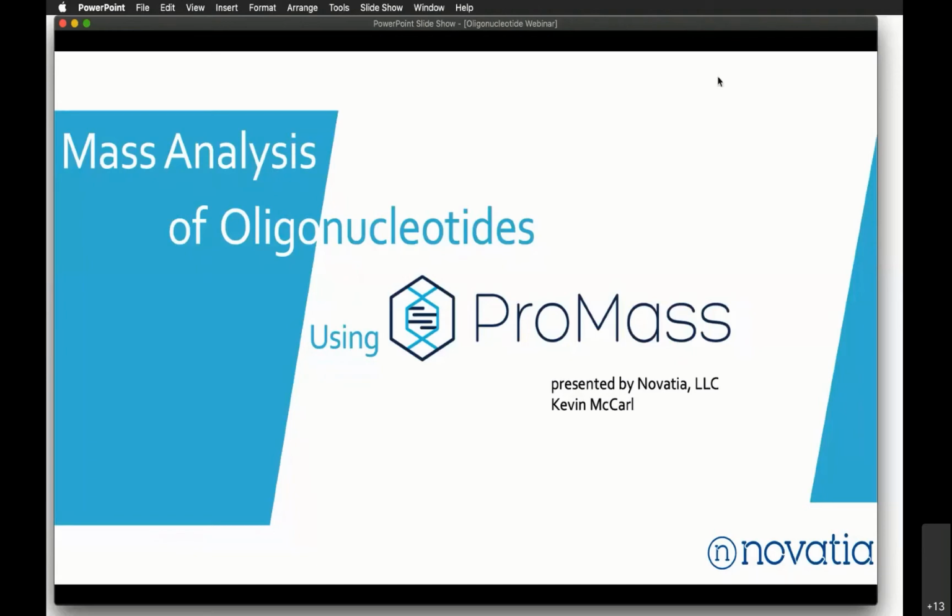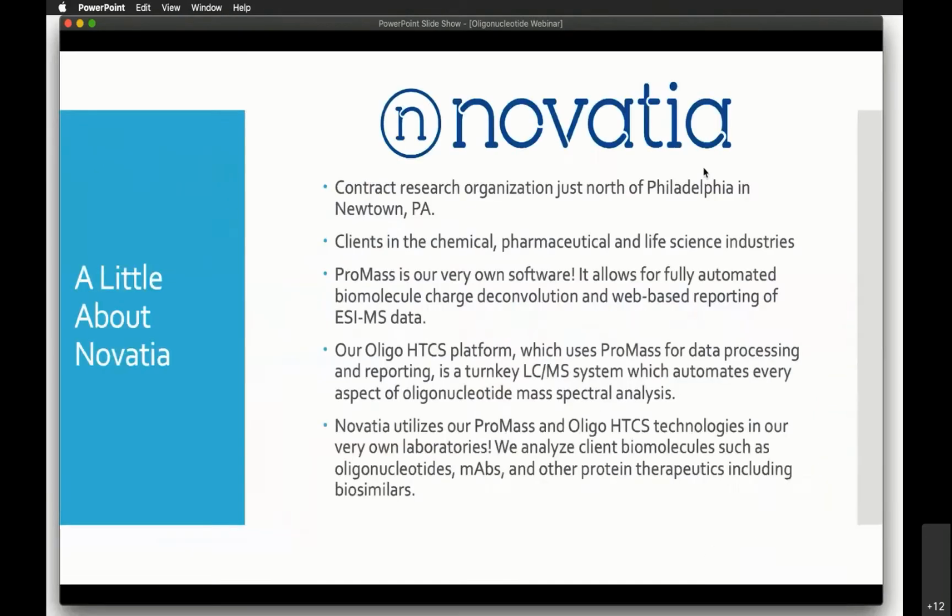I am Kevin McCarl, and we'll be doing a webinar today called Mass Analysis of Oligonucleotides using ProMass. All right, so let's go ahead and get started.